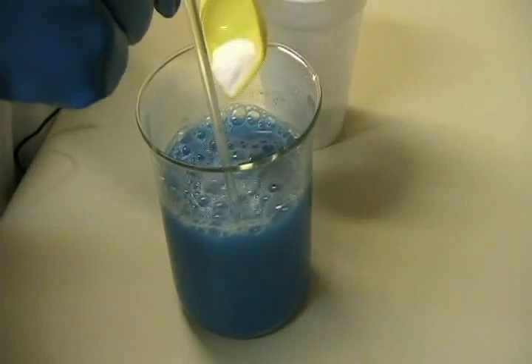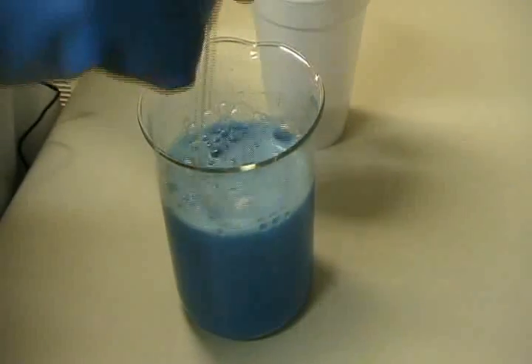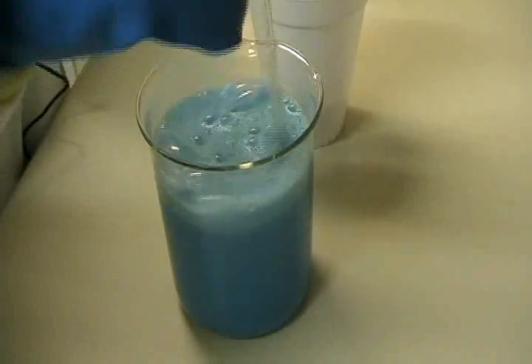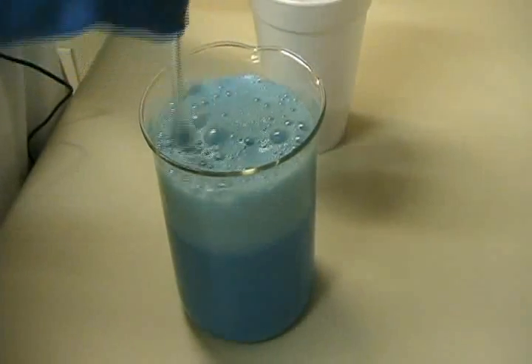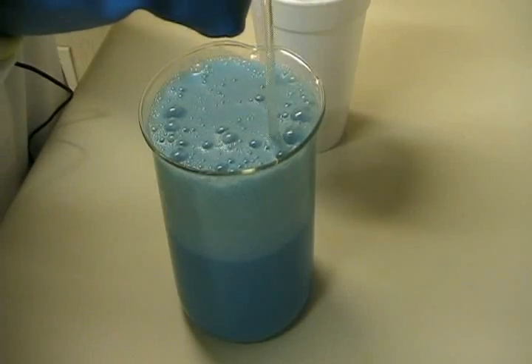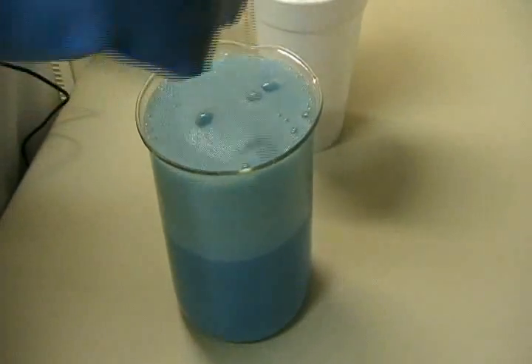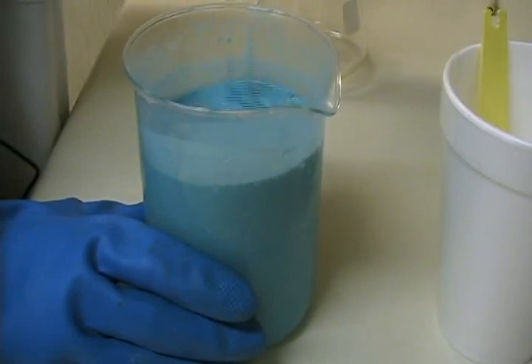Each molecule of copper sulfate reacts with two molecules of sodium hydrogen carbonate to form one molecule of copper carbonate, one molecule of sodium sulfate, one molecule of water, and — as you can see — one molecule of carbon dioxide. Once the reaction is complete, I will filter.